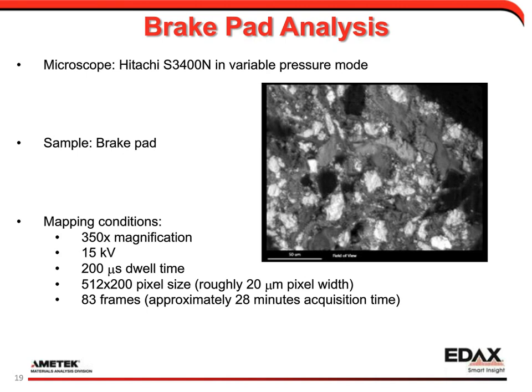So even if we apply our correction factors, we will potentially throw off the quant numbers a little bit. And we don't want people to have complete confidence that, oh, I applied a gold correction, so now I can do my analysis down to 0.1 weight percent of carbon or any other light elements. But we might include it in the future. It is up for discussion.